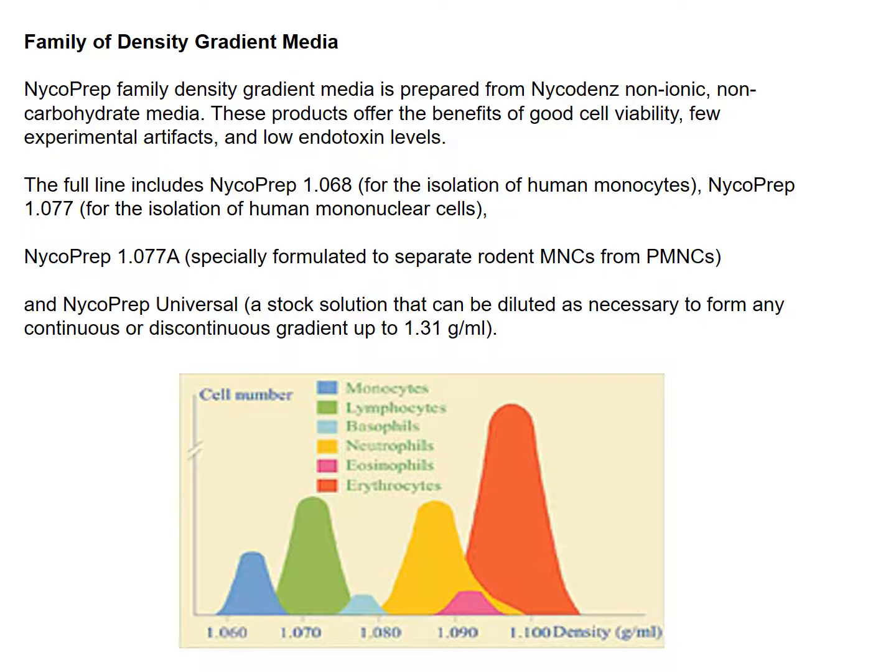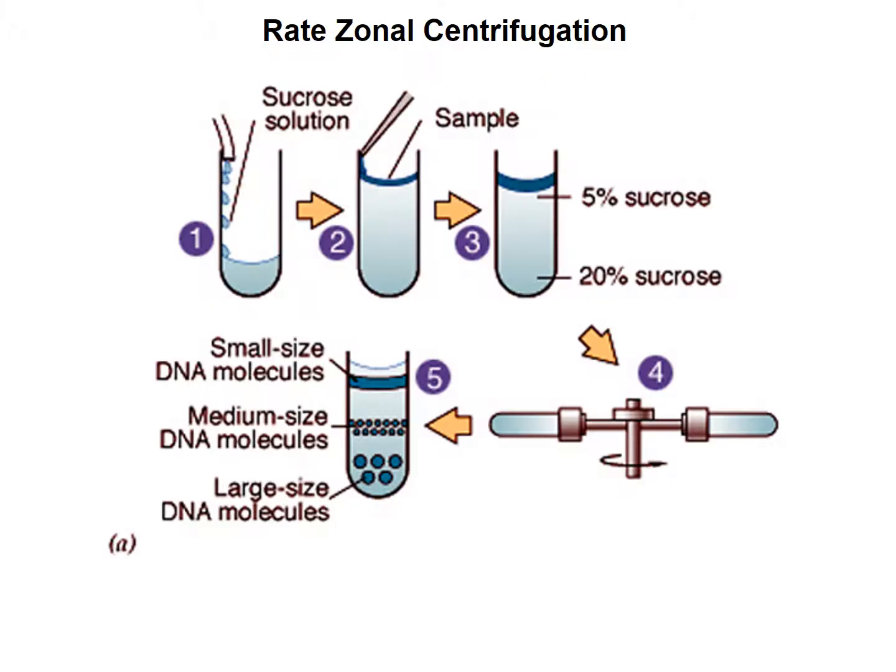Okay, and there's all sorts of different materials that you can get, something called NycoPrep, there's Percoll, and they were just, oh, that was good. Maybe it's about time for me to shut up. Oh, it won't go back.